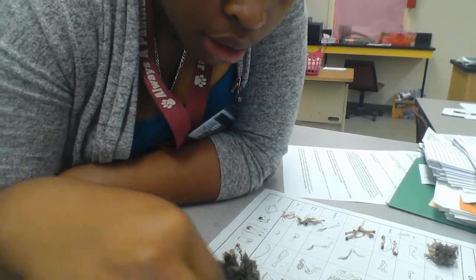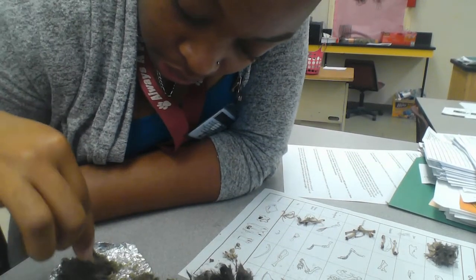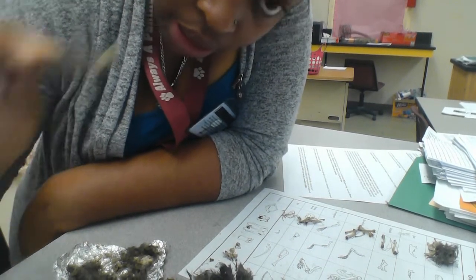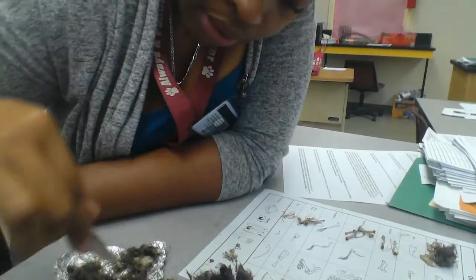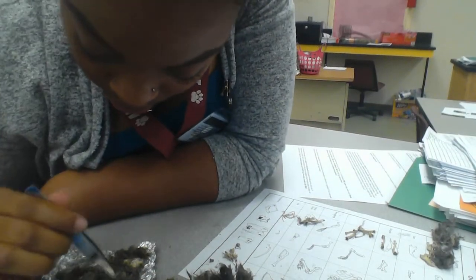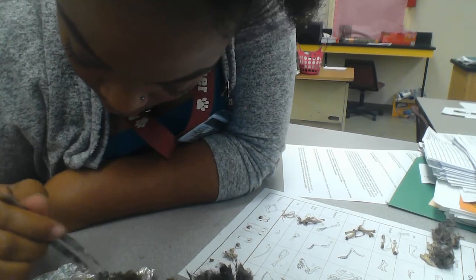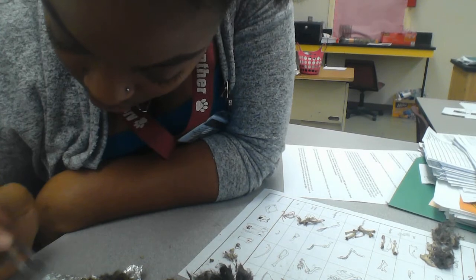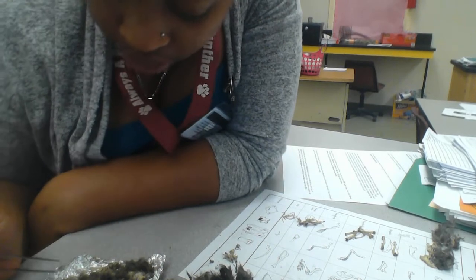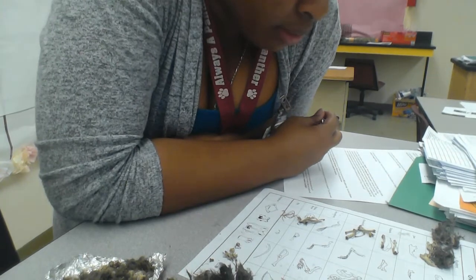All right, so there's so many other things to dissect here. But oh, I found my rodent head, so let's make those count. Well, this is the one we already found, but I found the other part to that rodent face, the other half, so that's officially 4. All right, and other things look like we just repeated already that I'm finding. All right, so I'm pretty much going to end the dissection here.